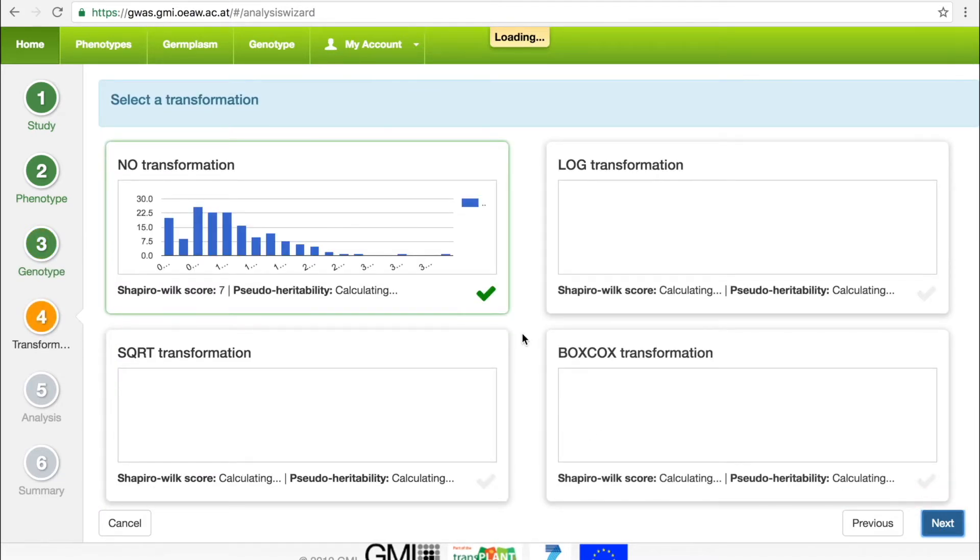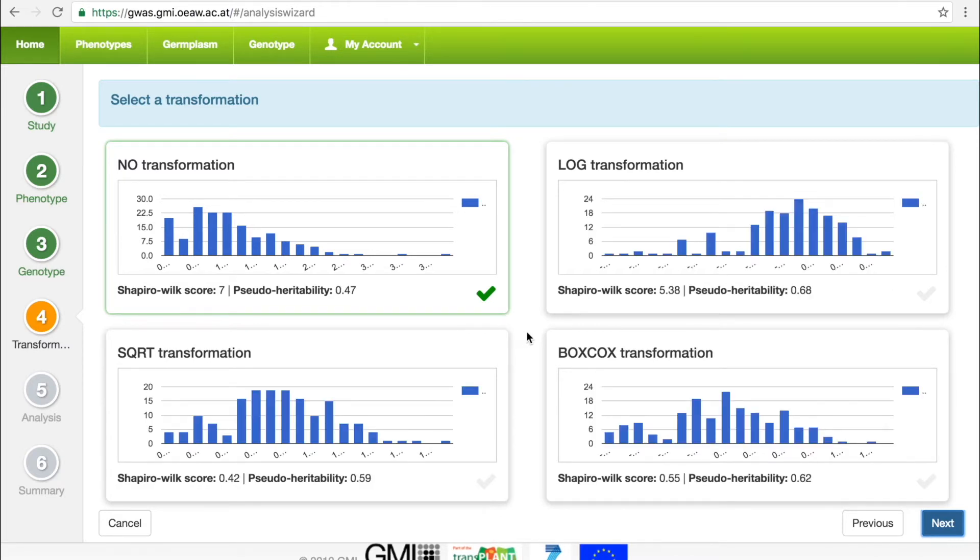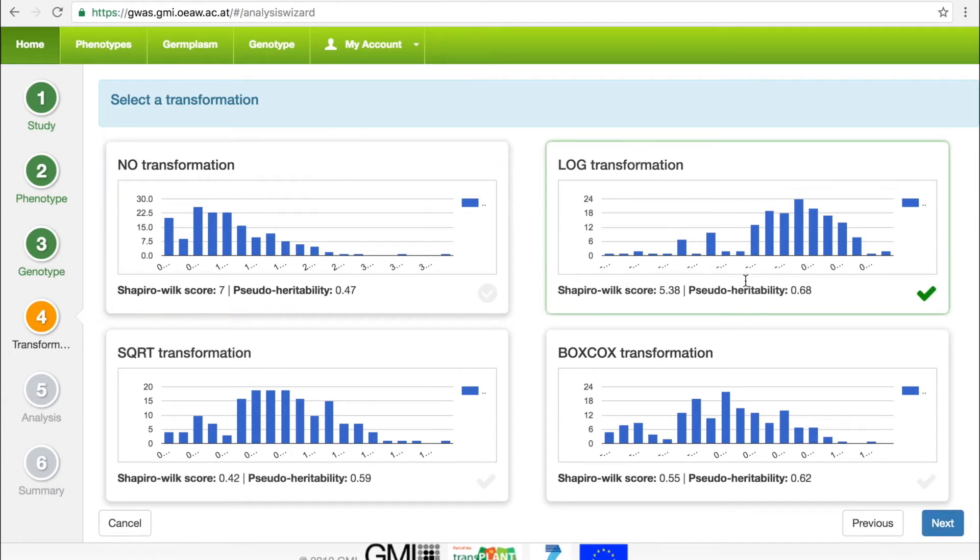In the next step, the user chooses a transformation for the data, and to help make this decision, the GWAS Portal calculates useful statistics for each transformation. In this example, we choose the log transformation.